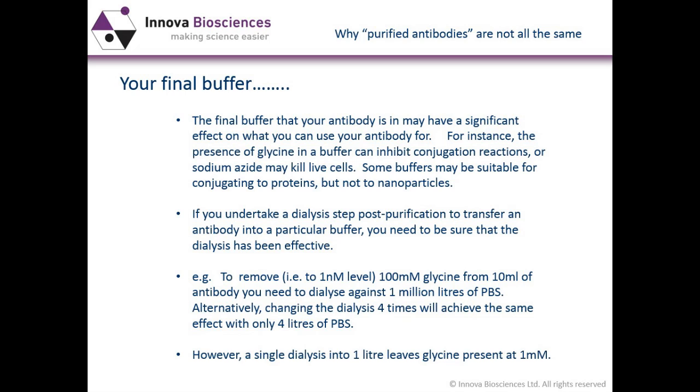If you're actually buying a commercial antibody, you'll probably find that most have been dialyzed into phosphate buffered saline, and many of you would want to do this yourselves. It's a very neutral, isotonic buffer that's useful for the widest range of applications. You undertake this by dialysis, but you do need to make sure that your dialysis has been effective.